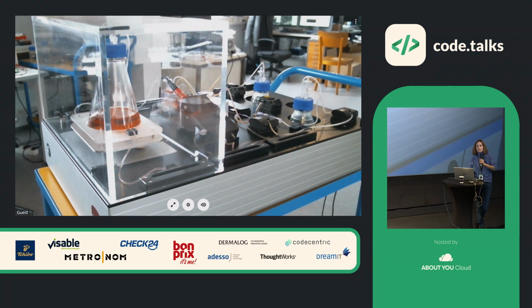So the logic itself is stored on the local machine? The transition from one phase to another phase is stored locally in the machine? What basically happens is that you configure your process, and then you send down what we call a process description to the machine, which is a JSON file. The machine parses it and saves the different phases in the machine.